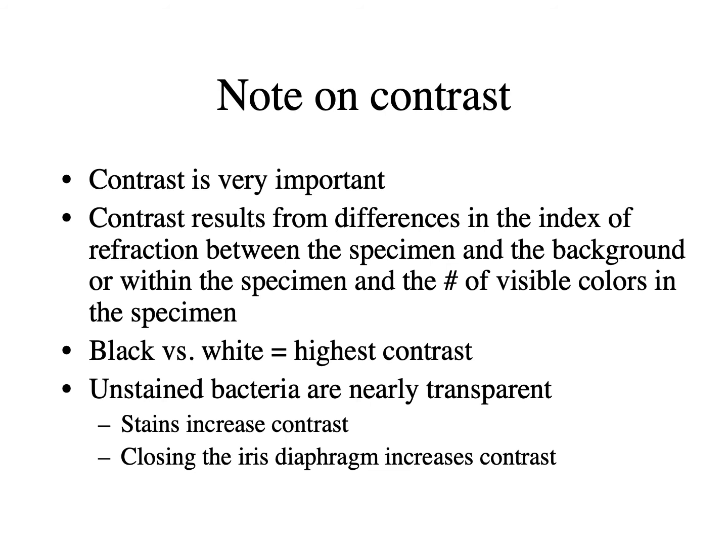So contrast is another important term in microscopy. For your eye, it's lightness and darkness. So contrast is what we need to add to a specimen that doesn't have any natural color so that we can see it against a white background. And we use a lot of different colors. They all have different chemical properties, but it's important to know that it isn't really that color. We've been adding all of these historically so that we can see something under the microscope.